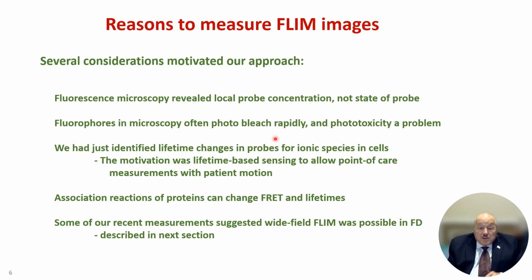So our motivations were to reveal local concentrations, the state of the probe. There's always photo-bleaching and phototoxicity. We had just undergone a study of looking at a number of ion-sensitive fluorophores.